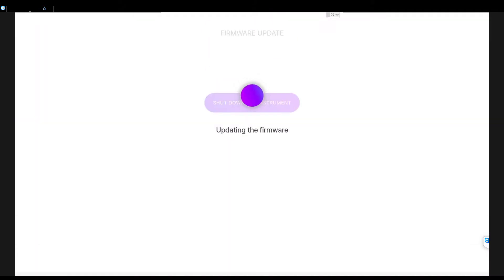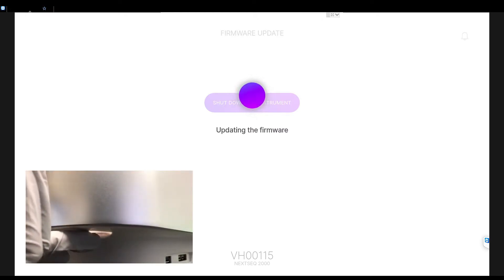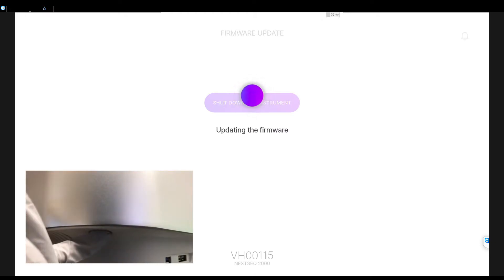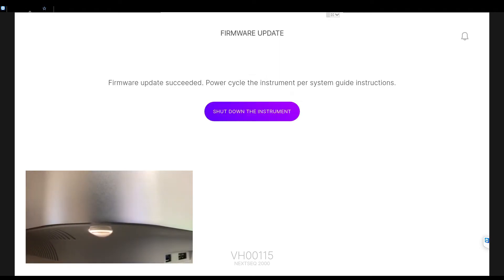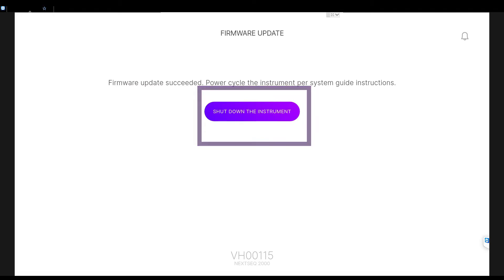Please note that during this process the screen may go blank. Wait for the image to return and the process to complete. If the image does not return after 5 minutes, press the power button at the front, bottom, right side of the instrument. If the screen returned, follow the prompt to shut down the instrument.